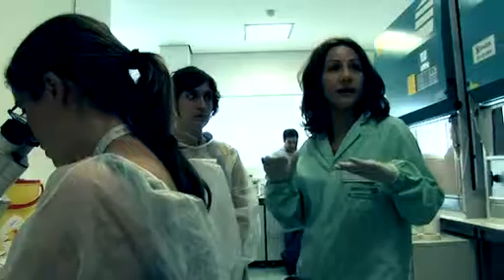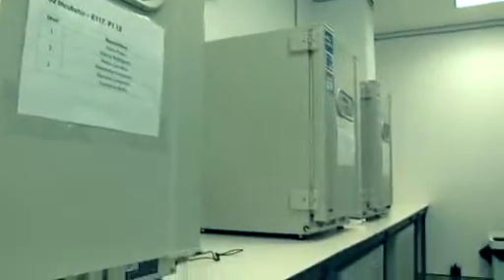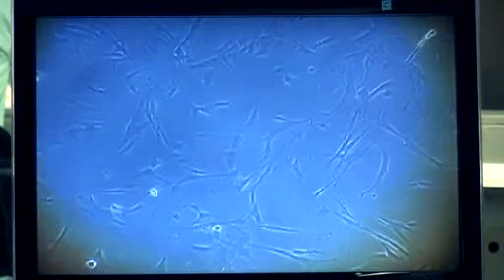The Cell Culture Lab is a cleanroom facility that has specific operating rules, and therefore only certified researchers are allowed to work there. Basically, we combine materials, and we always use materials of natural origin with stem cells. Stem cells that we always use cells obtained from the patient that we want to treat. So in this case, we are seeing some cells from umbilical cord that we have been isolating from umbilical cords that we receive from local hospitals.